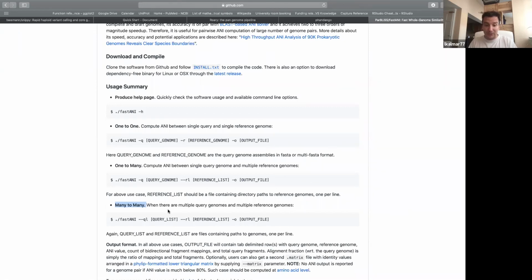The reason is that you will find a huge homology between those, and you don't really know if there is any real difference between 99.5 and 99.9% identity, because it can be caused not just by one or two SNPs, but also by differences in the assembly.